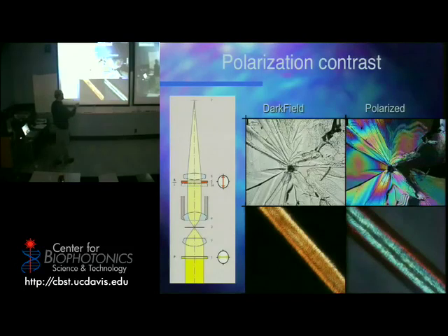So, in this case, I'm looking at a sugar crystal through a microscopy technique called dark field. Dark field is just, instead of having the light come through my subject, I'm going to shine the light from the sides of my object, and I'm going to see what light bounces back up into my eye, to my eyepiece. Okay? Bright field was the one we saw with the light from beneath. Reflection is the light from the top.